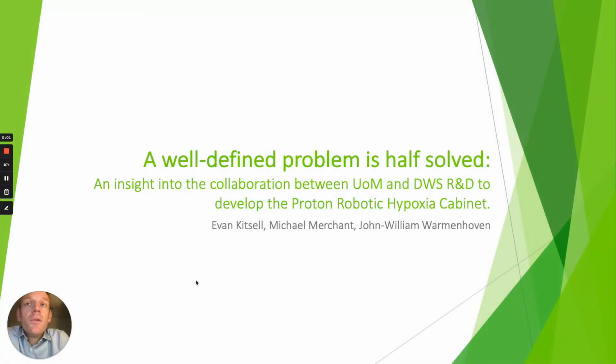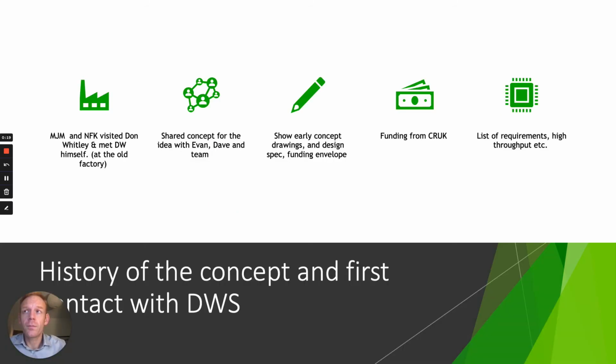Good afternoon. So it's my pleasure to tell you about the development of the Proton Robotic Hypoxia Cabinet at the Christie Hospital. So this was a collaboration between the University of Manchester and Don Whitley Scientific. And to borrow Evan's phrase, a well-defined problem is half solved. Well, we certainly had a well-defined problem at the start, but what we didn't have is a well-defined solution.